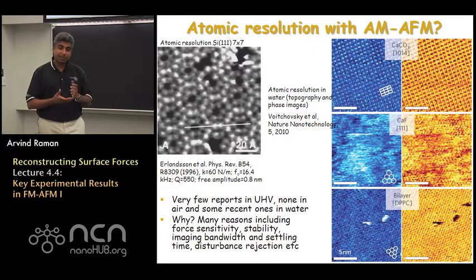It has to do with imaging bandwidth, stability, and so on and so forth. So the use of AM-AFM is typically not considered the standard approach to look at atomic resolution on surfaces.